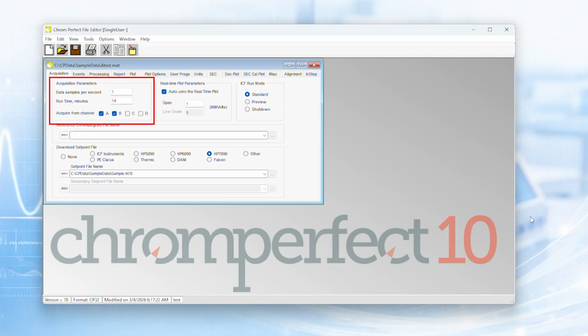If the sampling rate is too low, peak detail can be lost. If the runtime is too short, peaks may be truncated or not recorded. If the wrong channel is selected, the expected signal may not be recorded at all. If any of these settings are incorrect, the only solution is to rerun the sample.